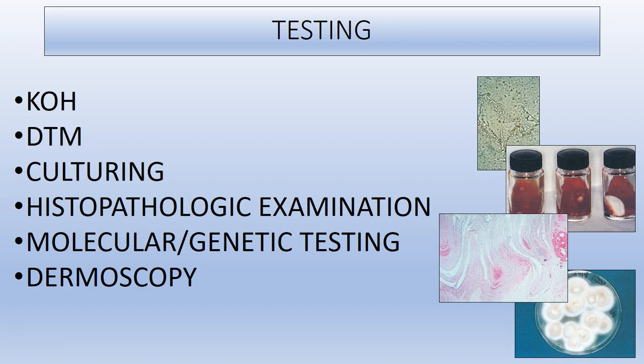The interpretation and reporting of PAS and histopathologic examination studies has become very sophisticated, and if one only requires identification as to yes or no there is a fungus, and yes or no there may be associated pathology, and speciation is not required, then PAS with histologic testing is probably the test of choice.